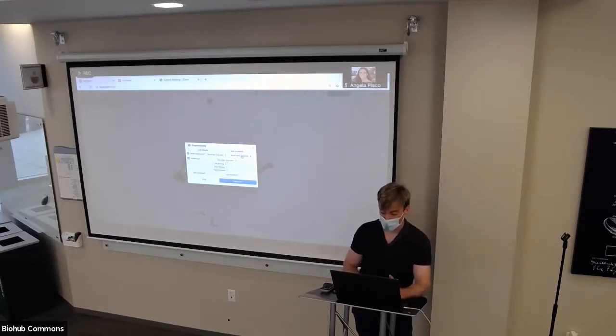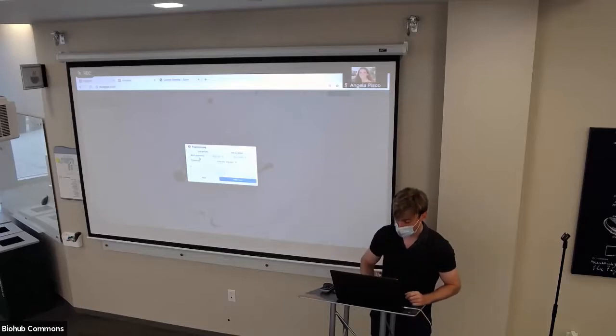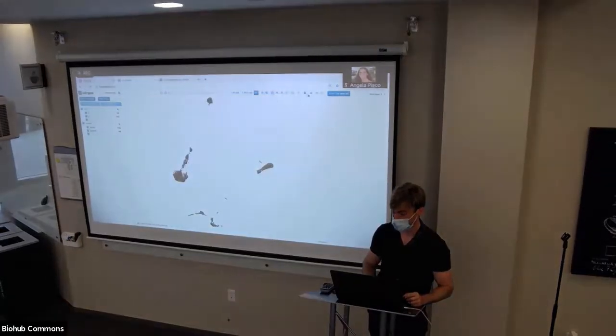And so all these options, let's say I do this, and let's say I make it like 5 or something, just to show you. Now, if I go to the other batch label, they disappear, because all those options were specific to just this particular data set. Unchecking batch preprocess just leaves everything back to as if you're pre-processing the whole data set. So that's pre-processing, but we've already pre-processed our data. So we're not going to click pre-process.